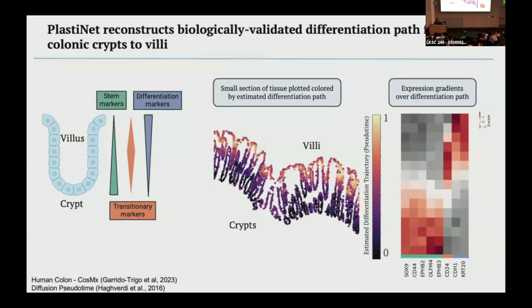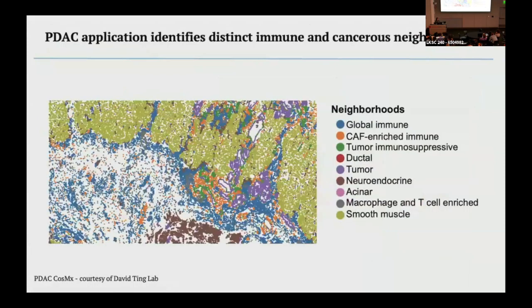and transcriptionally. We next applied this to a more complex spatial graph, PDAC, where our differentiation path of interest is EMT. We use CosMx data from primary untreated PDAC samples, courtesy of the Ting lab. The clustered results from the embedding correspond to these distinct tissue structures, which were labeled based on cellular composition.